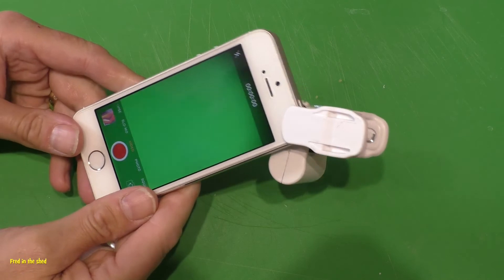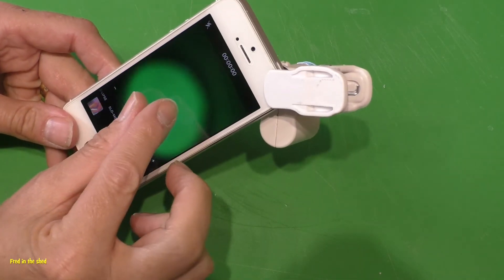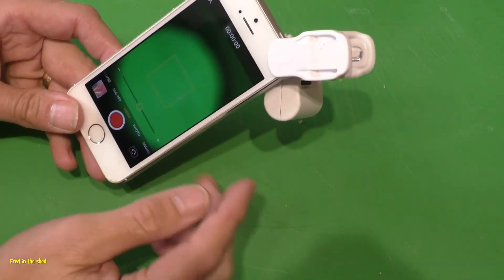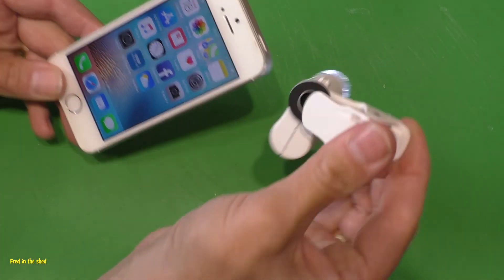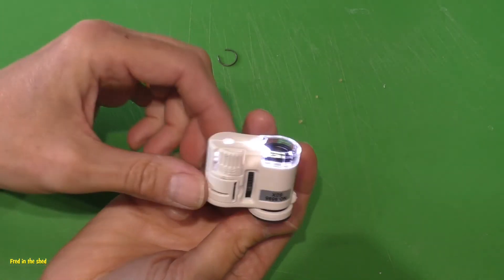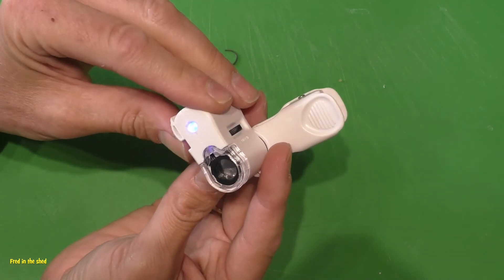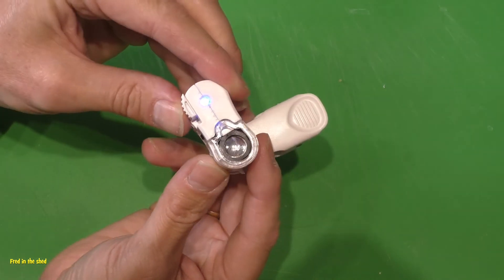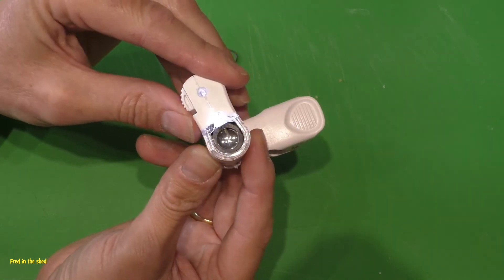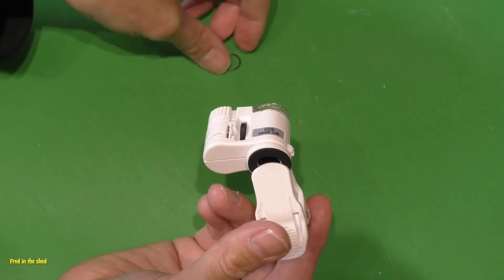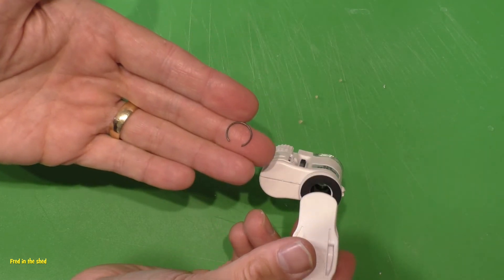In conclusion, to sum this up, what do I think? Well, it would have been nice if the product would have arrived in a usable condition and I didn't have to spend time taking it apart and trying to repair it. Just that little metal C clip is a very poor design - it doesn't seem to be held in with anything, and I can easily understand how that's fallen out. They'd have done better to have glued the lenses in with super glue like I did.